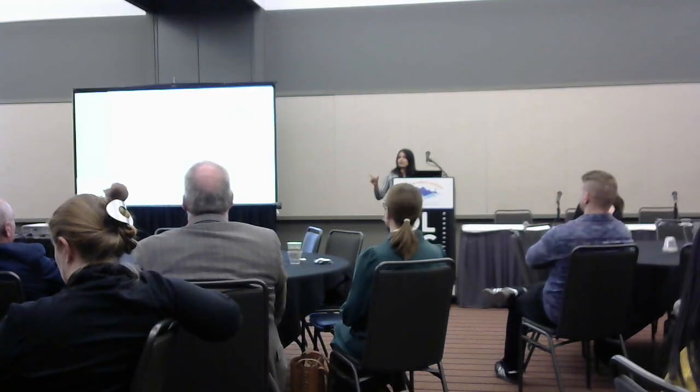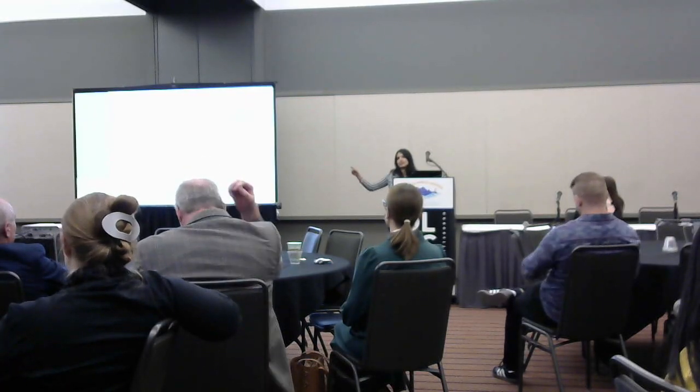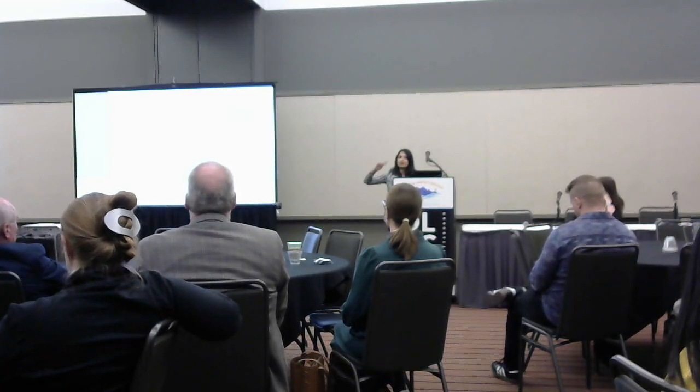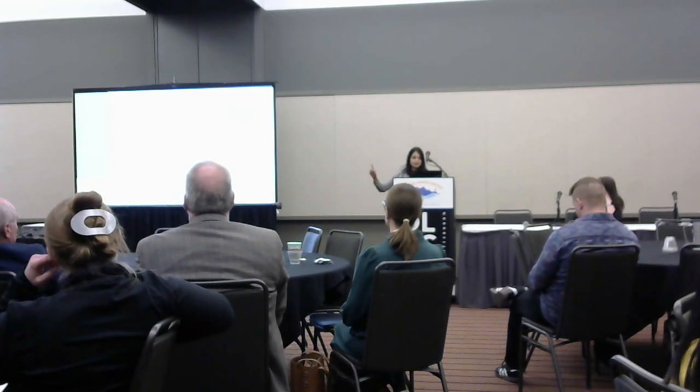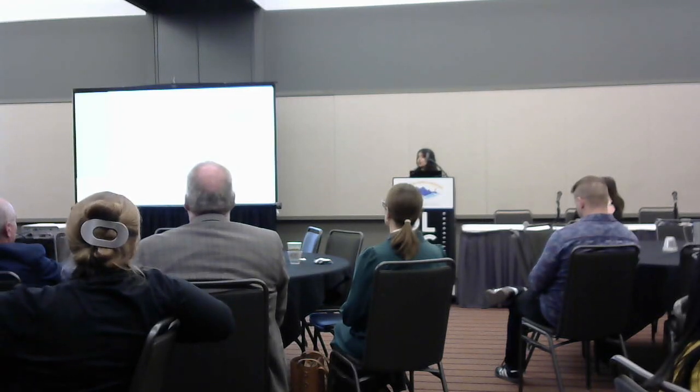And one thing I liked about this was also they have enabled a zero-click workflow. So there is a watch folder, and as soon as an acquisition is ended, it can actually automatically trigger your deconvolution or your post-processing or your analysis workflows. And they've also integrated this with some of their AI modules.